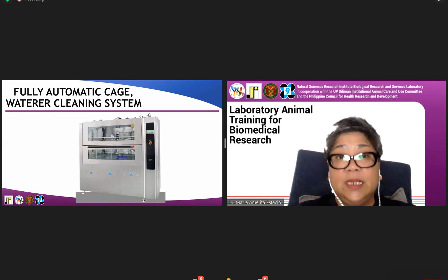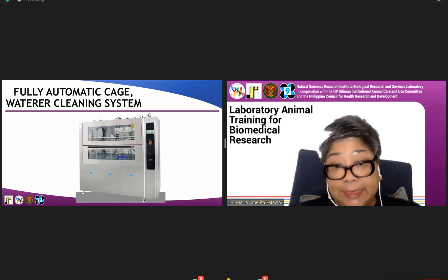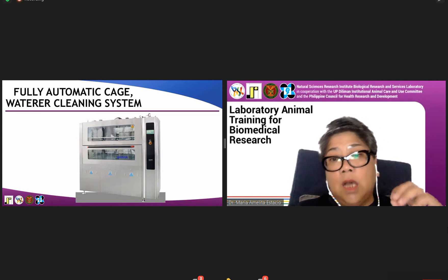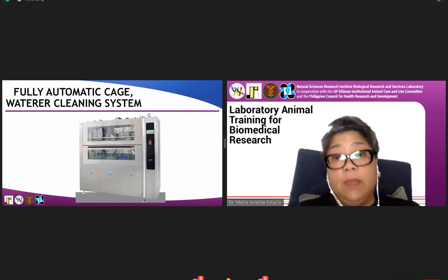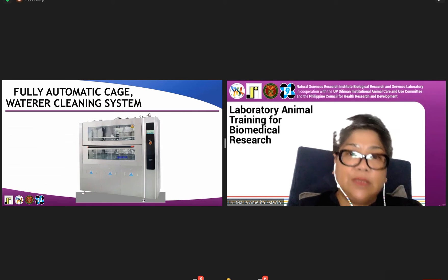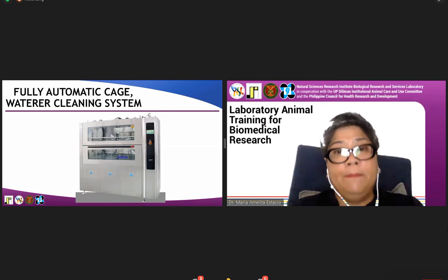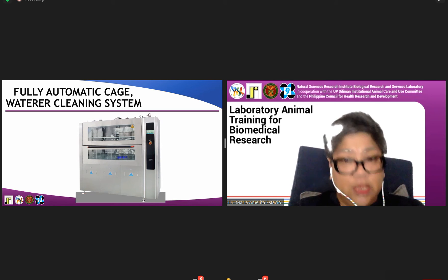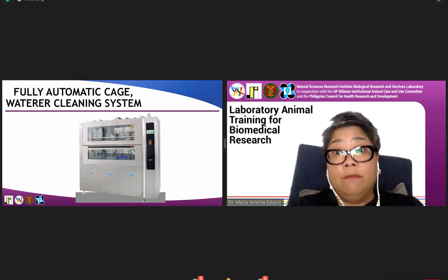For those that would be building their animal facility, there is a fully automatic cage and waterer cleaning system. This is a 40-cage, 40-waterer capacity high-pressurized hot water cage and waterer cleaning system. It can clean 40 cages in a matter of six minutes, saving you time and resources. It also ensures quality cleaning of your cages.